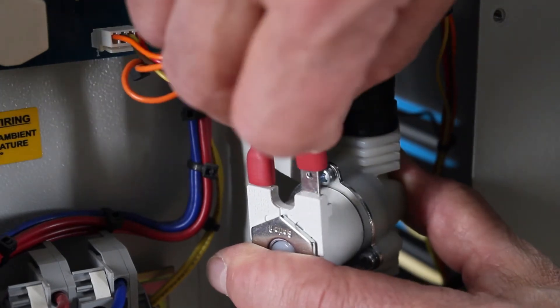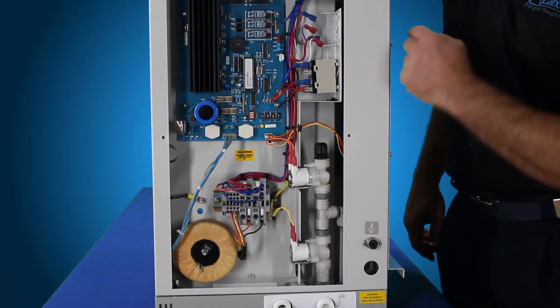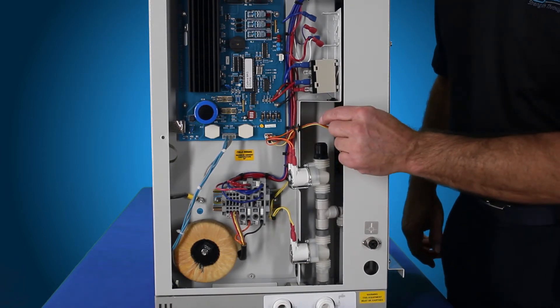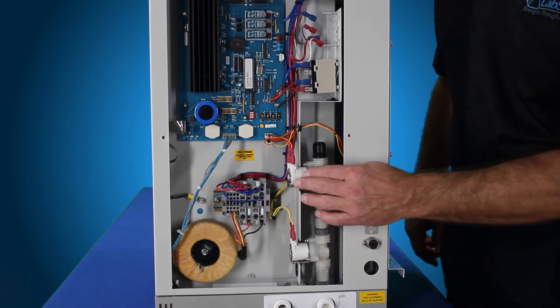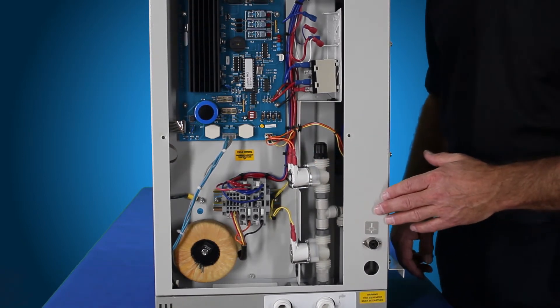Depending on whether you've got the 8 liter per hour or the bi-distiller, there's just going to be a piece of tubing coming out of here that goes to the very back end to a T. If it's a 4 liter, there's going to be a restrictor in here with a piece of silicone tubing with a hose barb fitting connected up into this jagged fitting. That's how you assemble the solenoid valve assembly on a FiStream 3 distillation system.